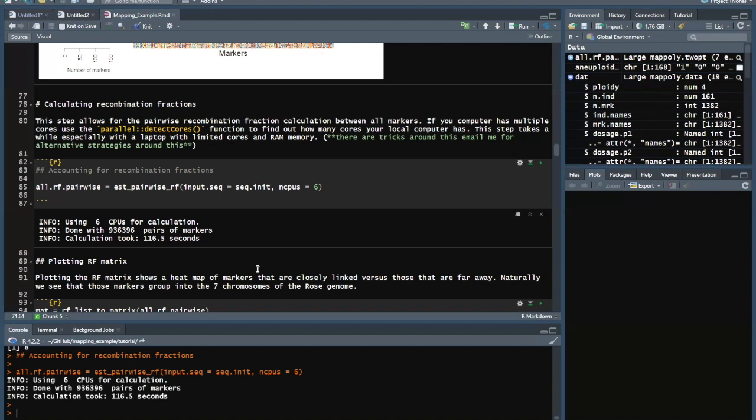Okay, does this program also take into account the SNP locations, only those locations which are present in the parents, to avoid any other erroneous genotyping calls in the progeny? So it depends. For MapPoly, you can choose whether or not to use the genomic information if you want.